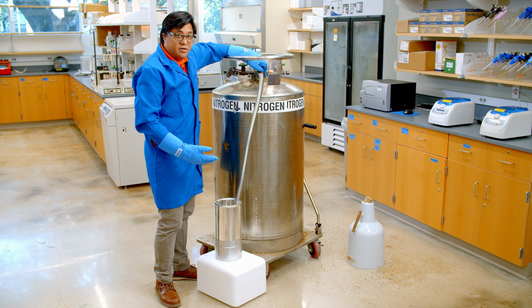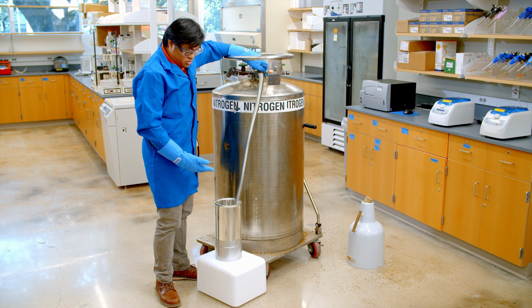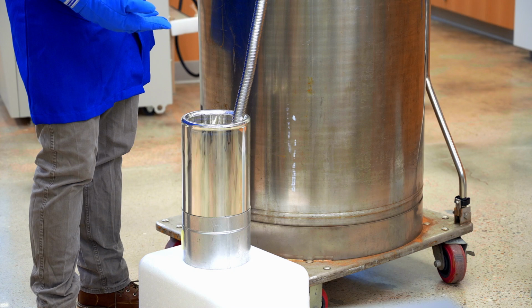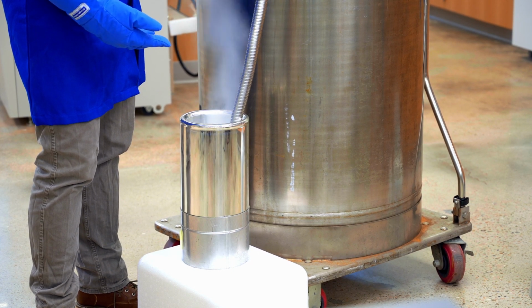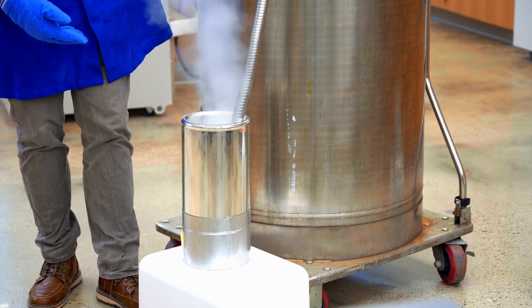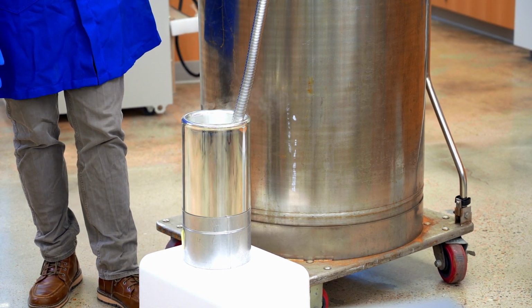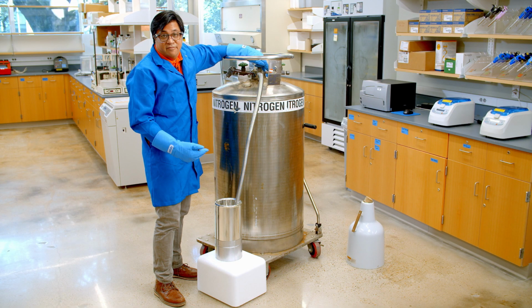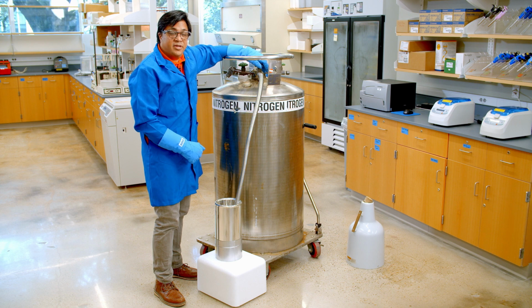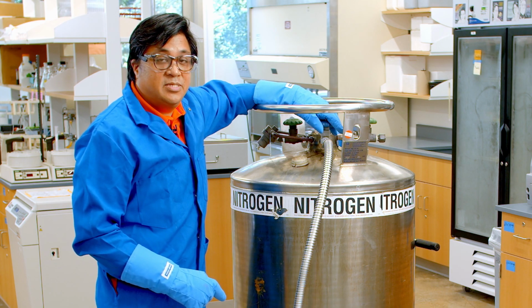This will allow the container to slowly cool down, at which time you can open the valve fully. Now, any excess liquid nitrogen can easily be disposed of inside of a fume hood by just leaving it inside your fume hood and letting it evaporate. Never place liquid nitrogen inside of a sealed container.